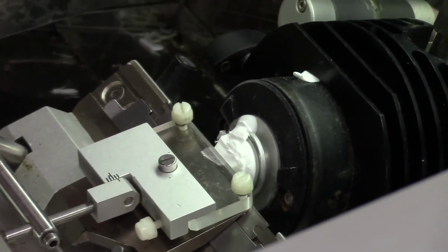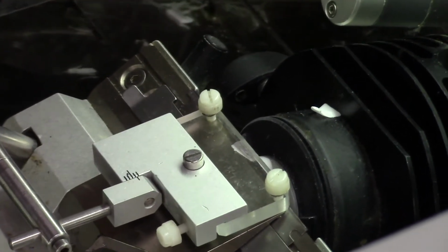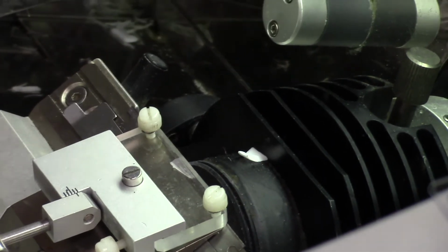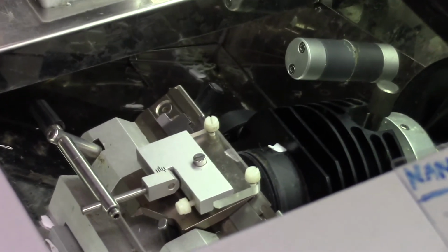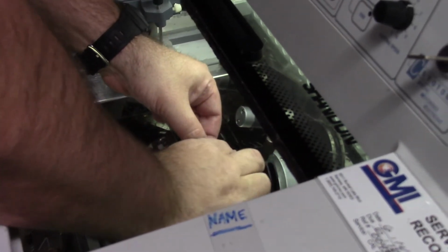So, oh yeah, did you see the right side of that one? It did not keep going, because why? What did I not do that I should have done? I didn't wash away any snow. I didn't wipe away with this paintbrush any snowflakes that might have been there. I think this one is still flat enough that I'm going to go ahead and try to save it. But it's not nearly as good as the others.